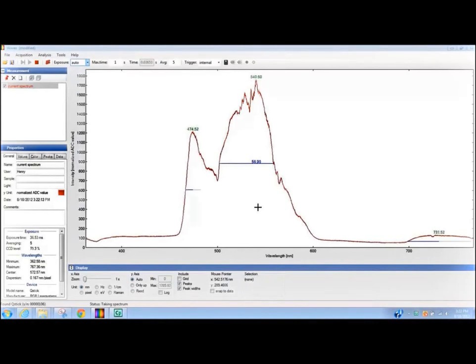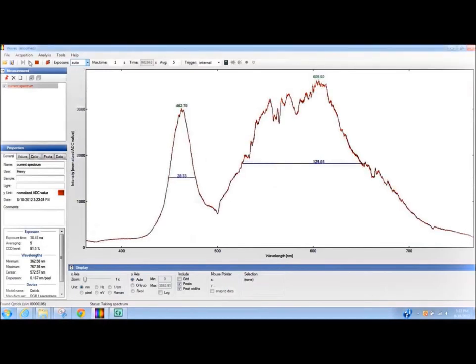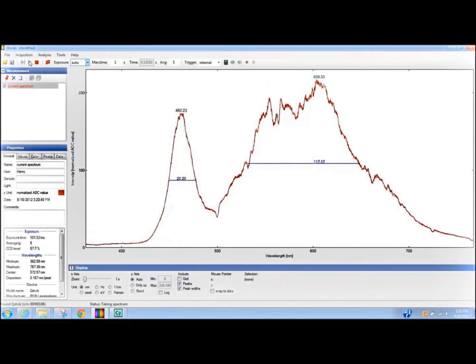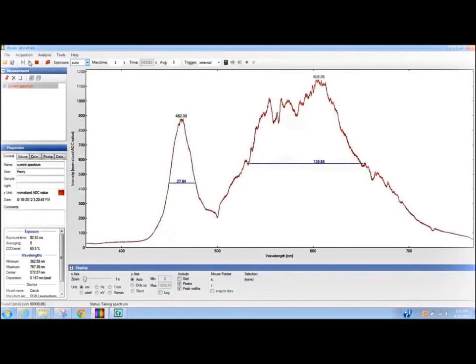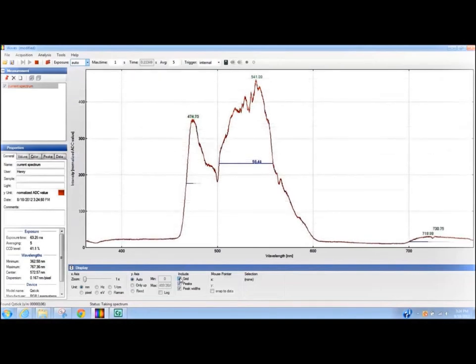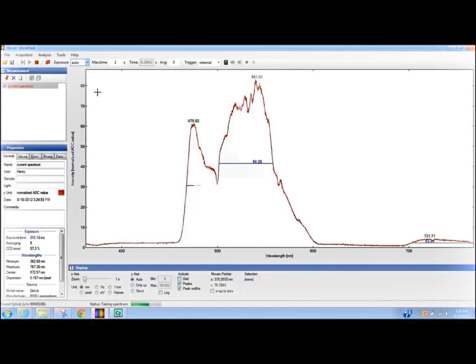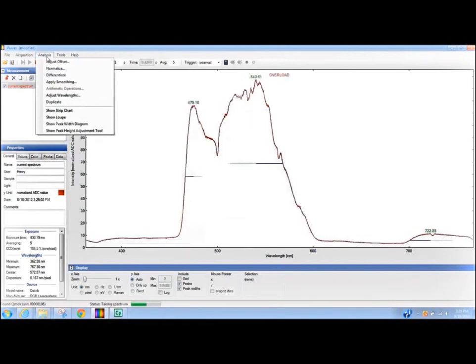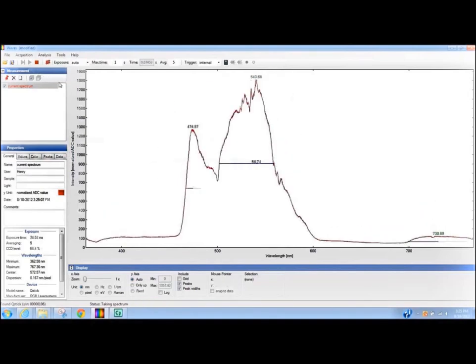We're fully connected hardware-wise, and we've booted up the Waves GUI software, which automatically detects the Q-Stick spectrometer. We hit the continuous data acquisition button — one click — and we're collecting beautiful data, as you can see. We're on automatic exposure, so the software is setting the exposure time to maximize signal and avoid saturation. It's also automatically giving you the wavelength of the prominent peaks. We're adjusting the light source to change various compositions between the red, green, blue, and white light, and the spectrometer is automatically adjusting to keep everything on scale at optimum conditions.